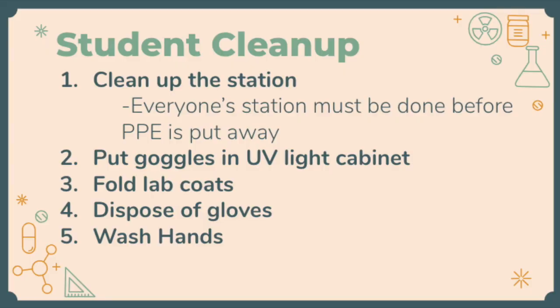The student cleanup procedure. Students must clean up their station. Everyone's station must be done before PPE is put away. Put goggles in the UV light cabinet, fold lab coats, dispose of gloves, and then wash hands.